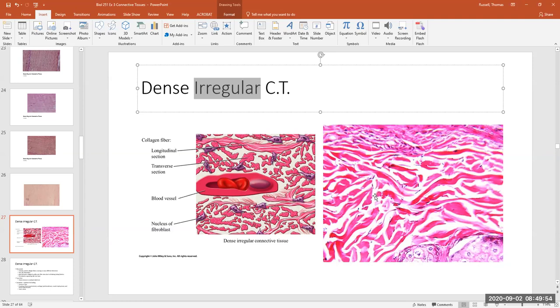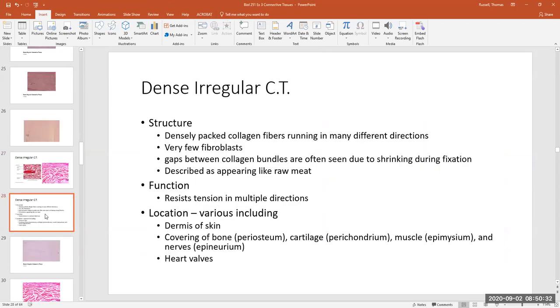All of this collagen looks like splattered pink everywhere in the slide. When you see a splattered pink everywhere, you know you're looking at dense irregular connective tissue. Dense irregular connective tissue is very vascular — there are a whole bunch of blood vessels in there. The collagen fibers are densely packed but there's no regular pattern, so they run in different directions — that's why it's called irregular.